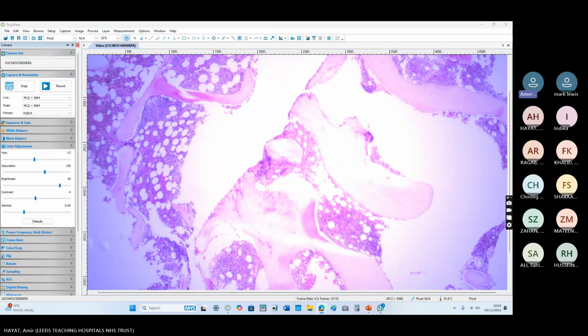The blood film was non-conclusive. No lymph node can be biopsied in him, unfortunately. Because of cytopenias, the team decided to do a bone marrow biopsy for this patient. And you can see the trephine in front of you. This is power 4.